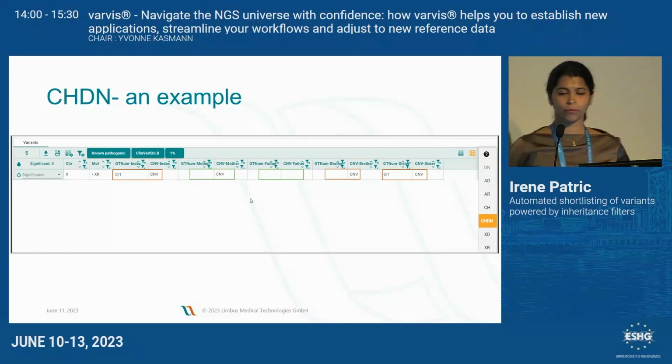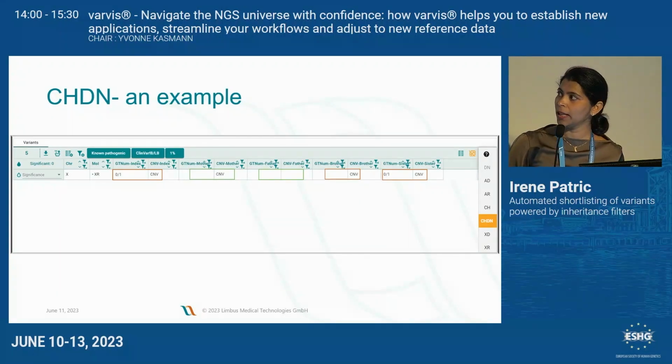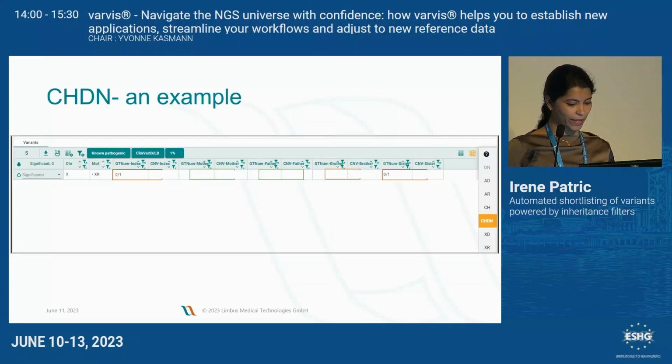And so I have to ask, what if a second hit de novo is not considered, for example? If the filter was very strict and we excluded this variant because you don't see the segregation that you expect. So that is one question. And the second question would be, what if the CNV information was not there?